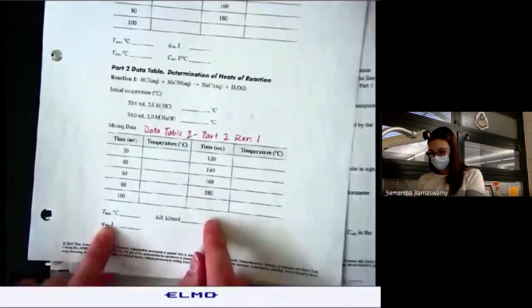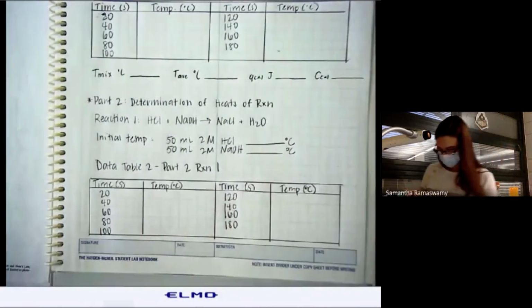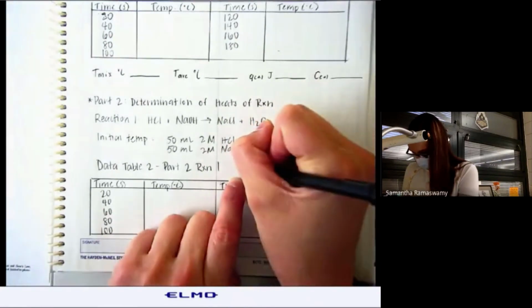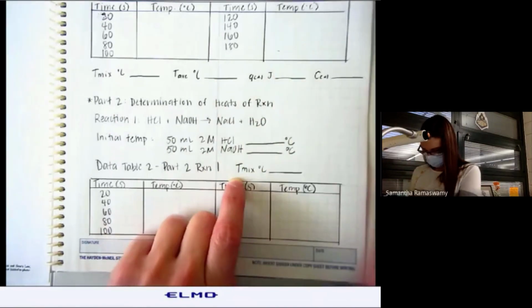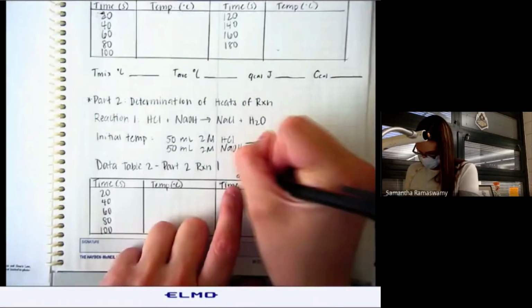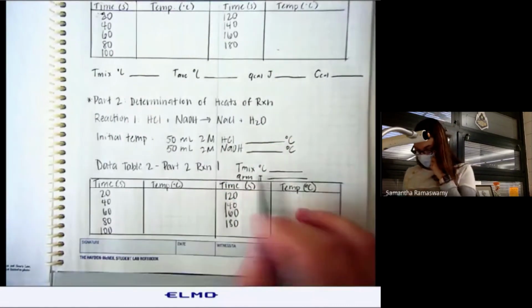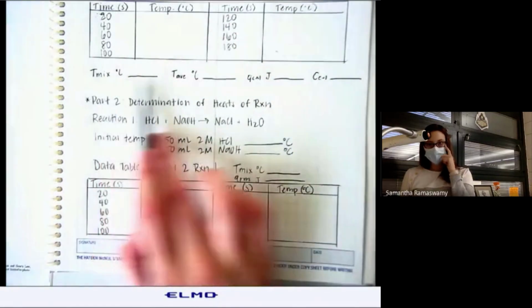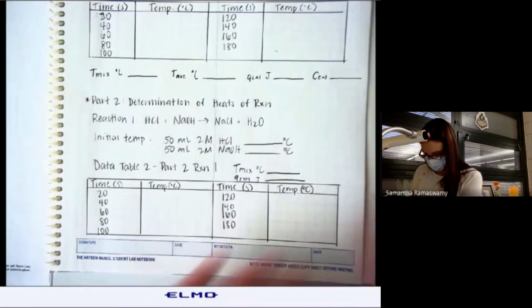All right, we have these 3 values down here. Oh, nuts, I'm out of space. I'll just do it over here. So we'll have T mix in degrees Celsius, Q reaction in joules. So like these numbers, I would put underneath the data table like I did these up here. I just ran out of space.